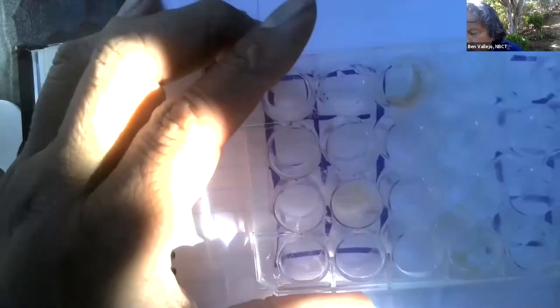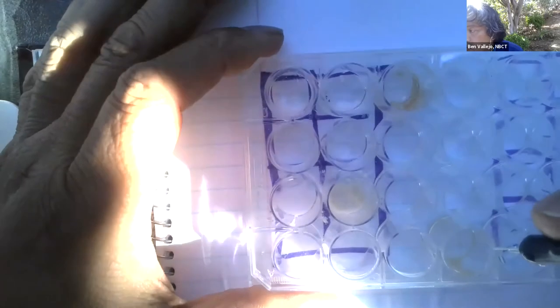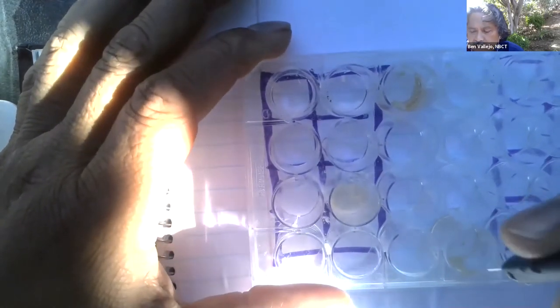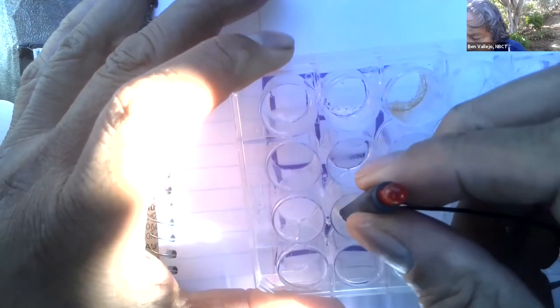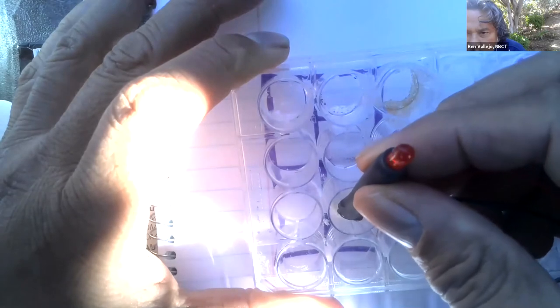Do we expect cornstarch to dissociate into ions? Do we think that cornstarch is a polar covalent molecule? Well, considering those, let's go ahead and just touch it and see what we get. Okay, there's the light. It is not lit at this point. Let's touch it. And it does light up just a little bit. You see it?